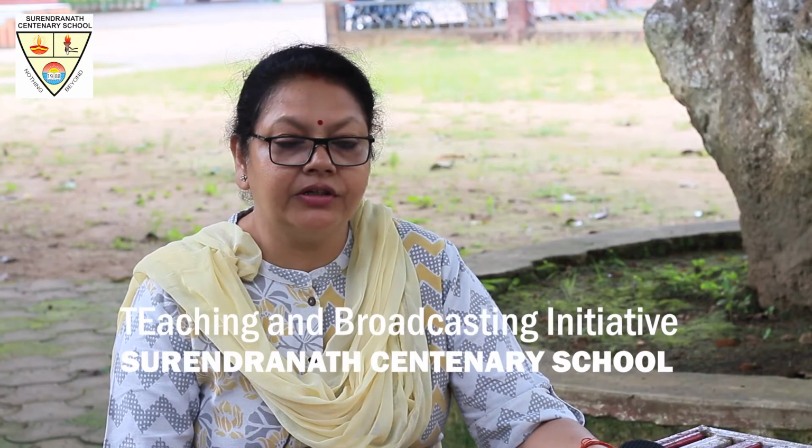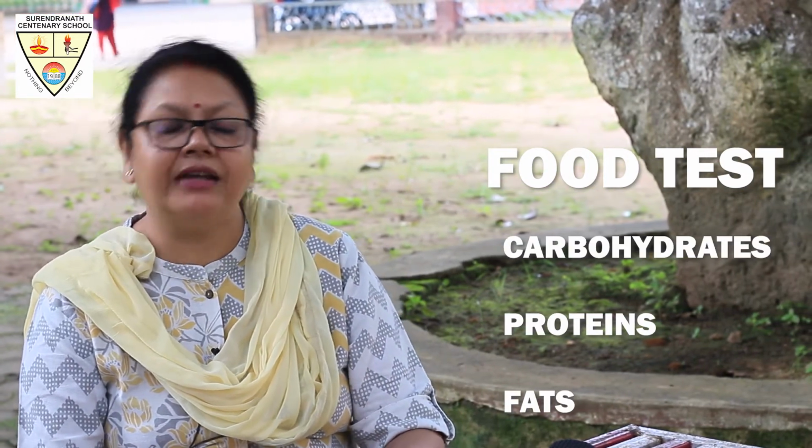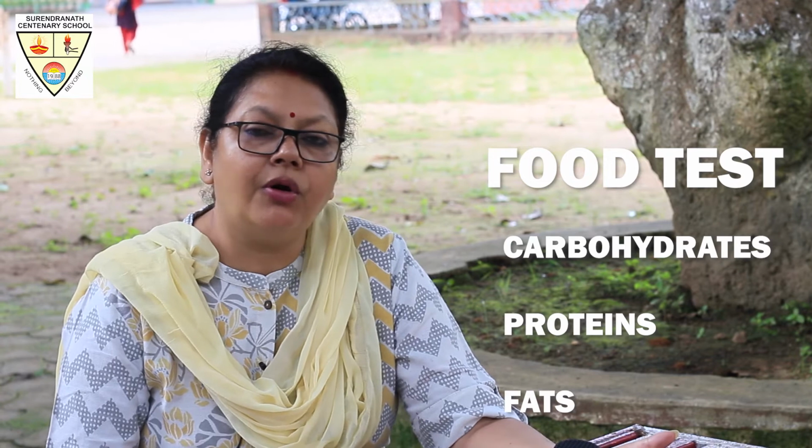Good morning, children. Today we start with our practical sessions for class 11 as well as for class 12. And we are going to start with the food test, analytical experiment for carbohydrates, proteins and fats. I'm sure you all have carbohydrates, proteins and fats in your food every day.